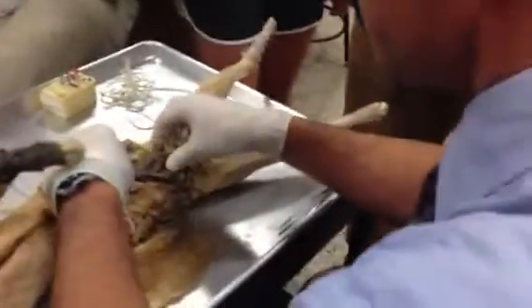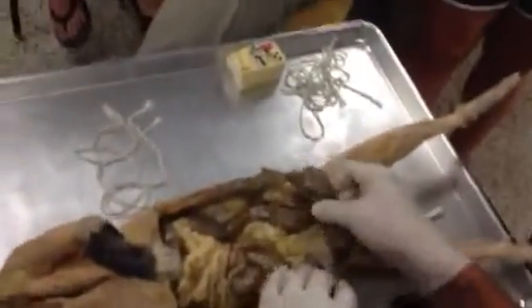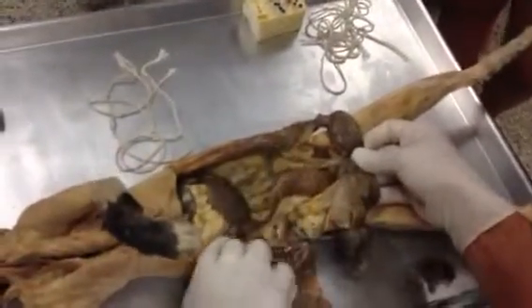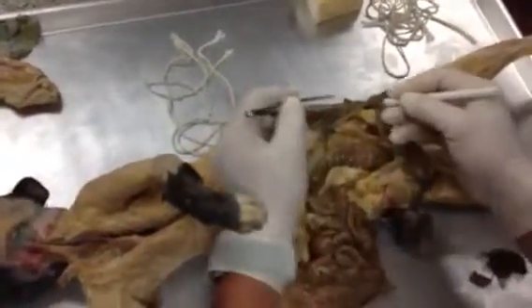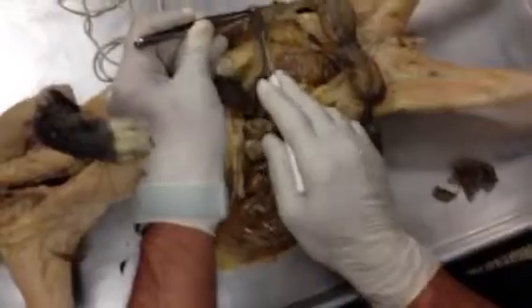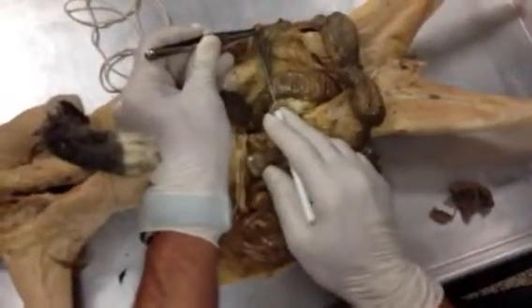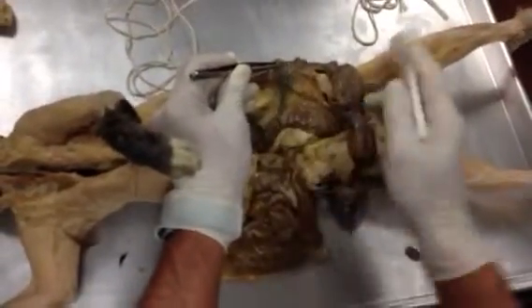Right, here is the female reproductive system, and I'll just do the pregnant cat. So she's also pregnant, right? So let's see, what do we have? We have right there the ovary. So there's the ovary on the left-hand side, and there it is on the right-hand side. And the location of the ovary, notice high up in the abdominopelvic cavity, much higher, ladies, than yours. All right, which means now more space.